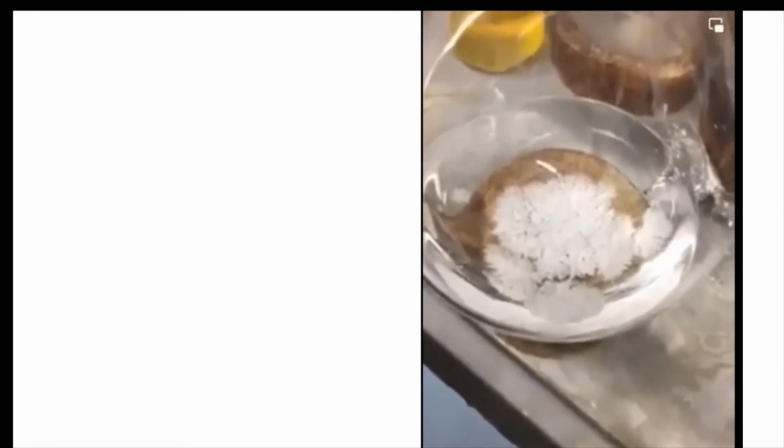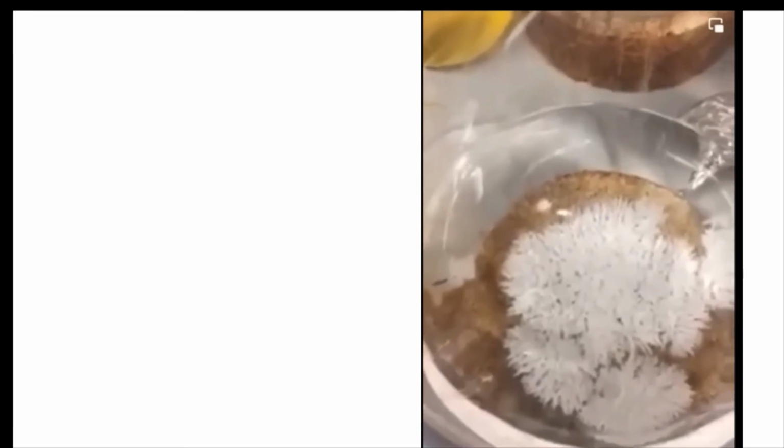I have also grown X-ray crystal structures from carbon disulfide. Yes, it is smelly and also kind of carcinogenic, so be careful. Sometimes if you have many aromatic rings, or buckyball type or helicene type compounds, then you can grow crystals from carbon disulfide, CS2.